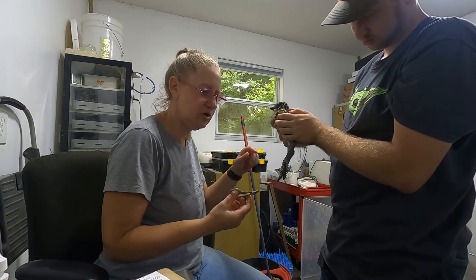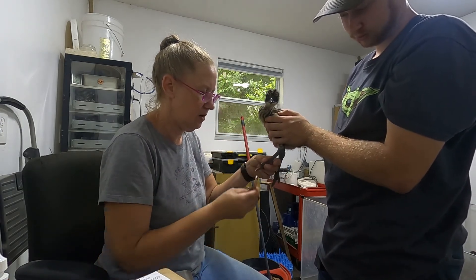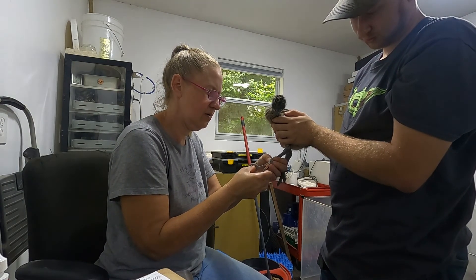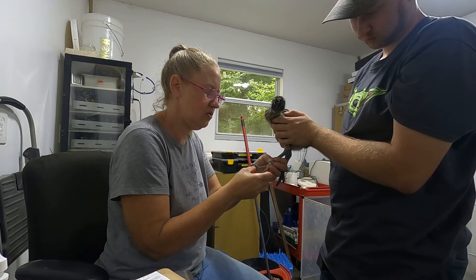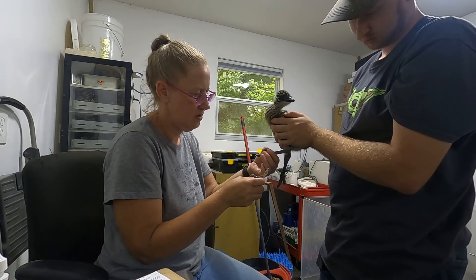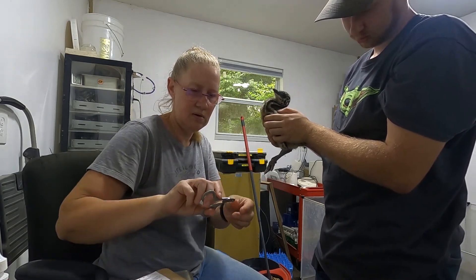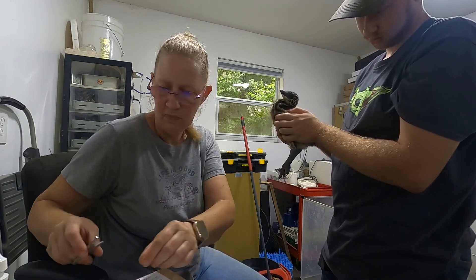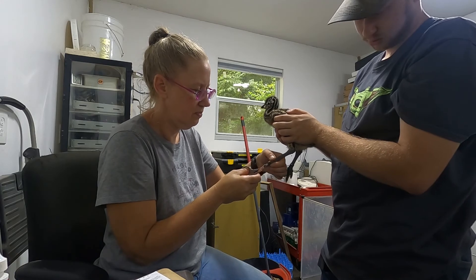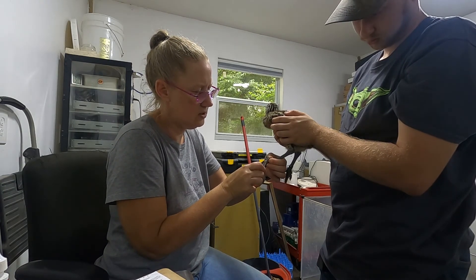These guys are little so I've just got a pair of clippers for like cat nails. I cleaned the toes off real good. We want to go ahead and clip that toenail so that we draw a little bit of blood. Obviously we don't want to get into the flesh, but we want them to bleed fairly good so that we can get a decent sample.